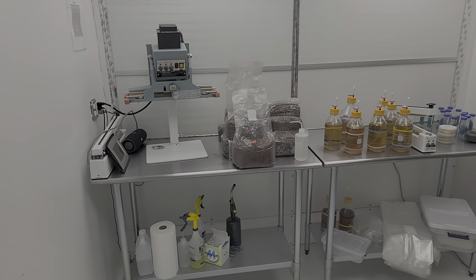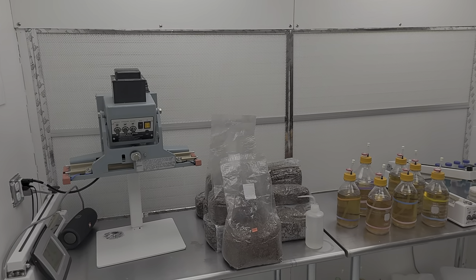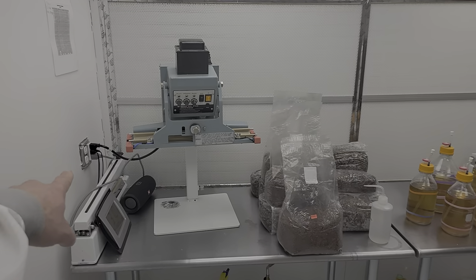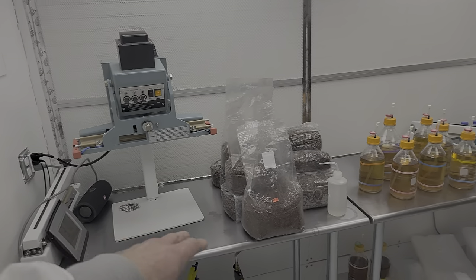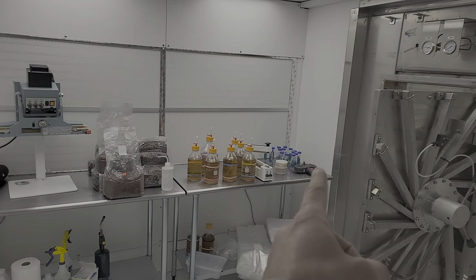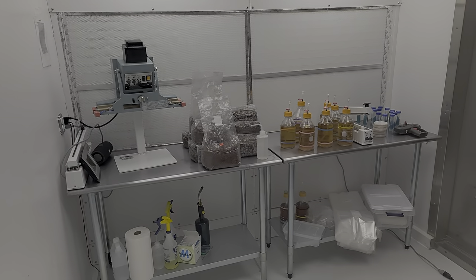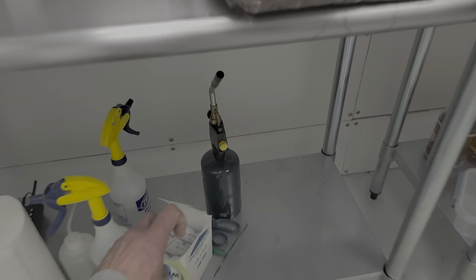I'm realizing I need more outlets in here. When working by myself I use up to three impulse sealers, and especially the big ones basically need their own circuit. I have one dedicated circuit but I'm also tapping off it for another sealer, which is a no-no. I need to make sure they never run at the same time. I'll be upgrading — adding another outlet over there and one over there, probably 220V, and getting some 220V sealer models so I'm not pulling stupid wattage on 120V.